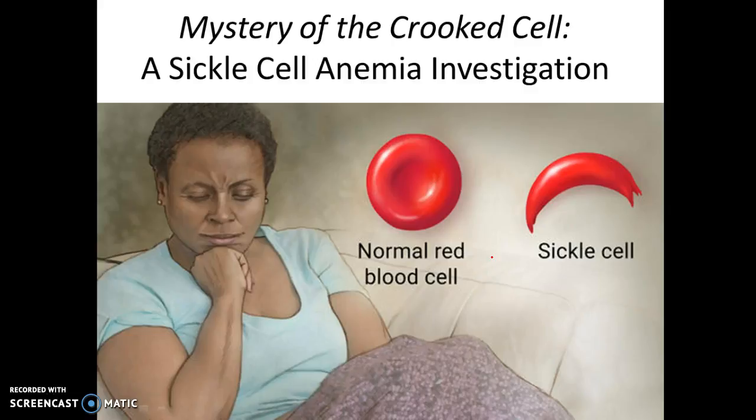You should have already read the first 3 pages in your lab manual, and hopefully you're watching this video second. It's okay if you're watching it first on Educated. I'm just going to explain a little bit about sickle cell in this video, but more about the actual experiment that we're going to be doing on Friday.